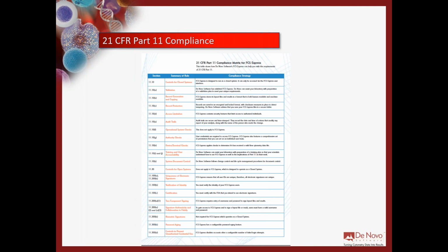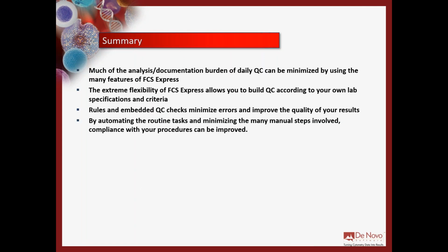And very, very flexible and powerful 21 CFR Part 11. There are other software that purport to be 21 CFR Part 11 in the flow space, but if you even give a cursory look at what the actual functionality that is provided to you is, you will see that FCS Express is far and beyond anybody else in the business at the moment. Okay, so please feel free to reach out. We actually have webinars on the website at the moment that detail a lot of the aspects of our 21 CFR Part 11 compliance features.